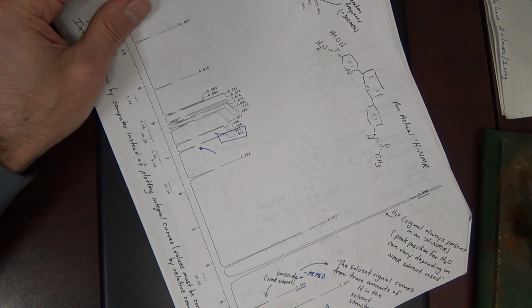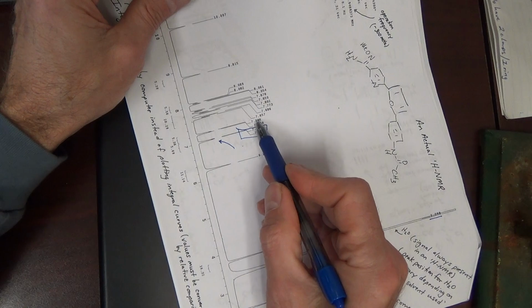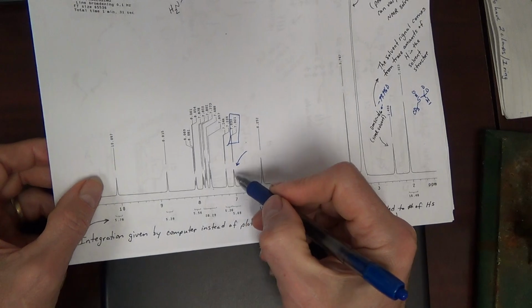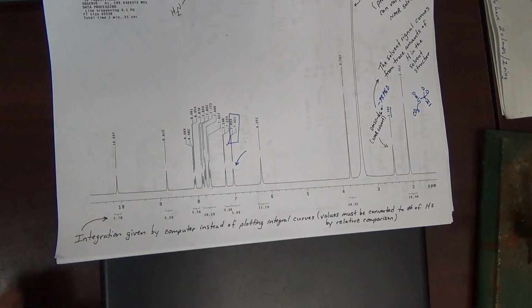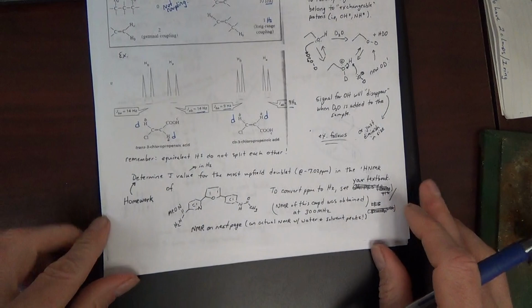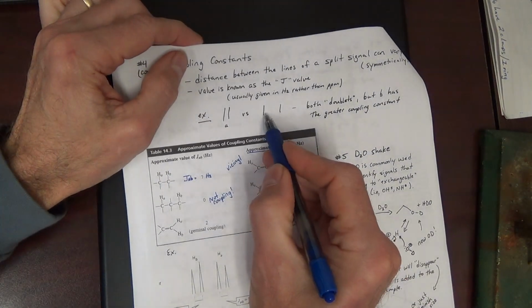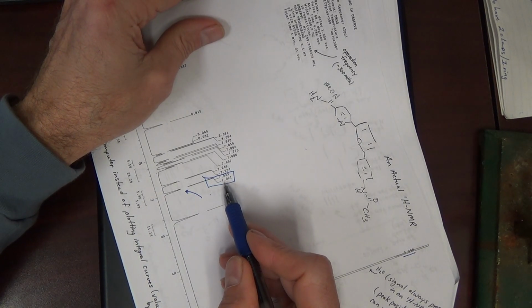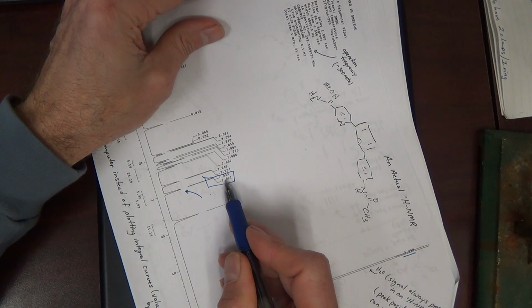Now the peak next door is also a doublet, but the most upfield doublet would be this one here, and the question asks you to calculate the J value for this doublet. Let's review a little bit. The J value is just the distance between your 2 lines. The distance between the 2 lines in ppm can be given just by subtracting your 2 ppm values.